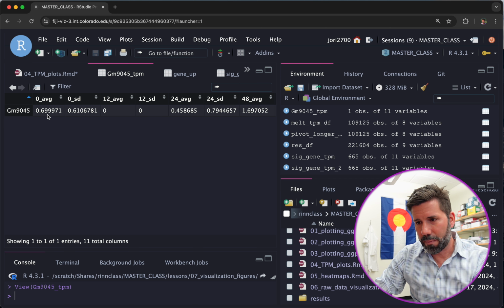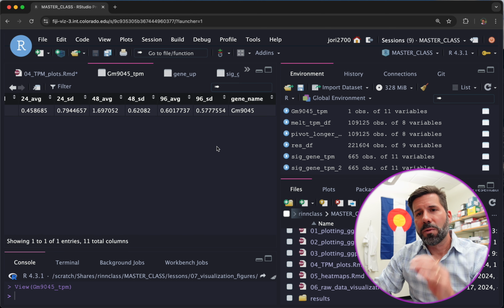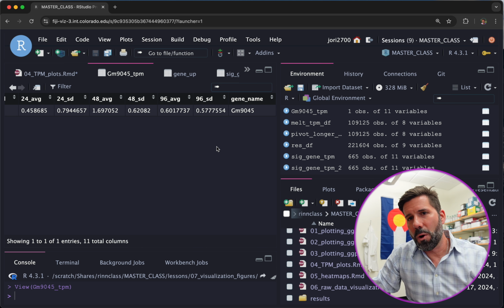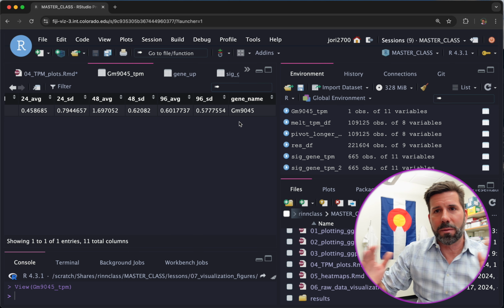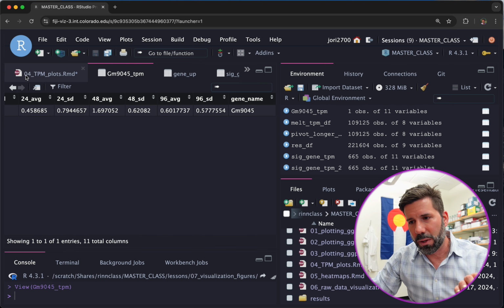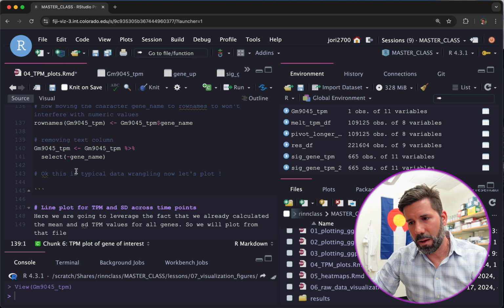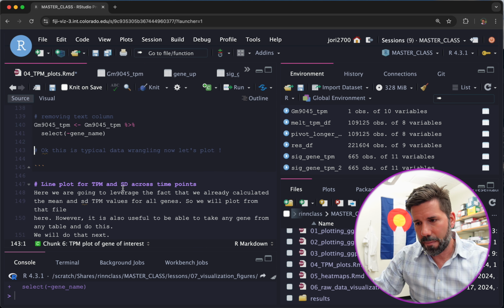Where's gene name? It's at the end here. So now that we've labeled the row in meta, we can get rid of this value here. So that's kind of a typical thing: add a column in so you can merge or join or filter, and then take it back out after you've put it into meta as a row name. Okay, getting rid of that column there.